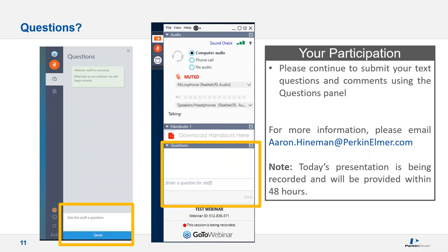You could use inter-element correction equations. Those tend to work also, although it still could be challenging if your interferent and your analyte are interfering with each other. I guess it really depends on the extent of the overlap. Yeah, those are good examples. You can use IEC, you could use off-peak integration. There's a couple of different approaches.